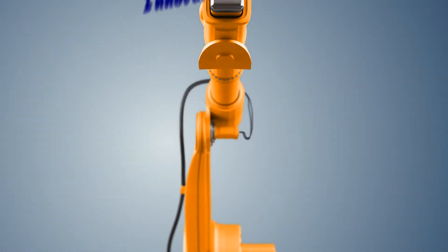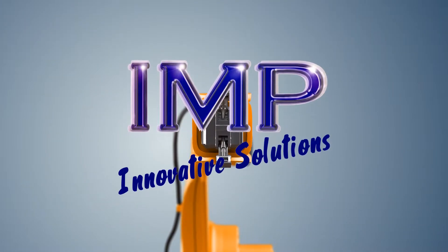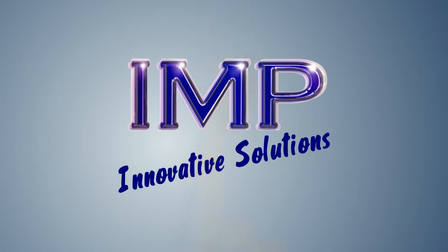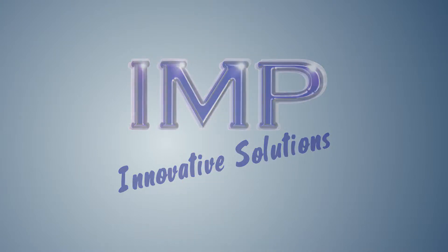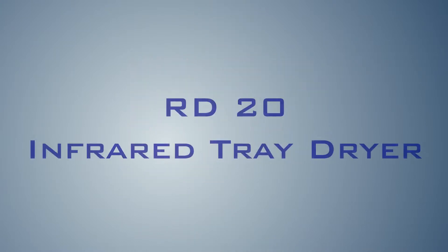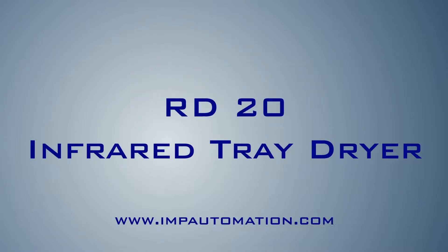IMP presents the latest innovation in sample drying, the IMP RD20 Intelligent Series Infrared Tray Dryer.